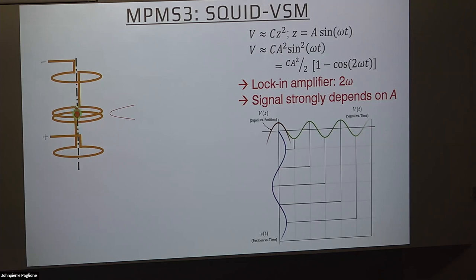And it's getting into the weeds a little bit. It's not only the temperature at the sample location, but a little bit away. And we take a weighted average of them to actually calculate what the true center location is. But yeah, very good question. Right, we're not measuring the voltage as a function of position. So how do we know where the center is, right? We're just measuring the voltage using a lock-in amplifier.